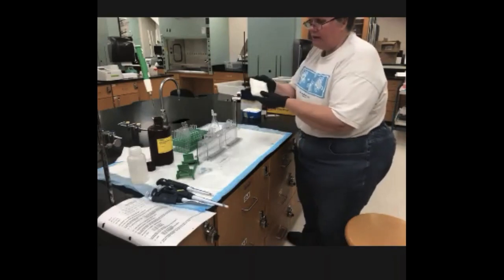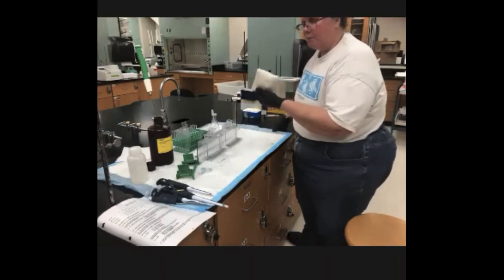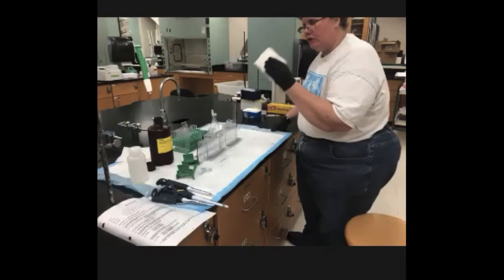So it's basically pretty much airtight until the next class period. You want to keep it nice and moist until the next class period.